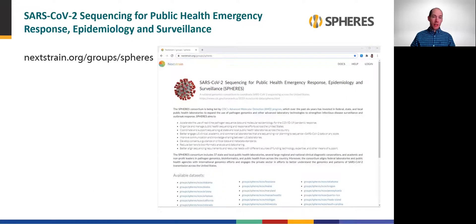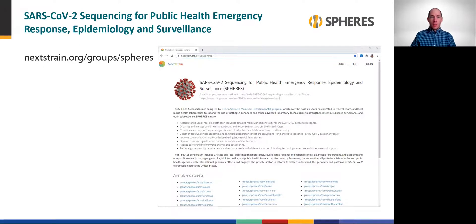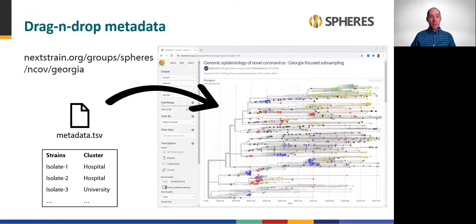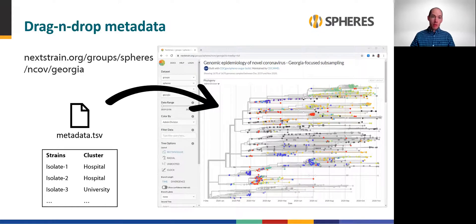You can review a number of public Nextstrain builds maintained by CDC and the SPHERES Consortium. These are calculated from publicly available SARS-CoV-2 genome sequence data focusing on each of the 50 U.S. states, Washington D.C., and Puerto Rico. I encourage you to explore data from your area using the link here. These state-specific SPHERES builds, like the rest of Nextstrain, are fully interactive, meaning users can drag and drop metadata tables to highlight sequences of interest in the browser. For example, I can add a two-column table of strain names and some fictionalized case cluster identifiers that I made up for this presentation.